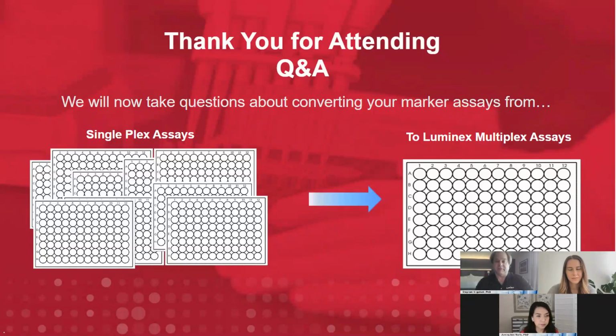Now we have people going into influenza and other viruses. But the thing is, you can actually minimize a lot of the matrix effects, because sometimes you have to use your sample at such a high dilution, but you still get your data, and you eliminate some of those matrix effects that you might get with other assays where you have to use your sample more concentrated. So it pays off in that respect too.